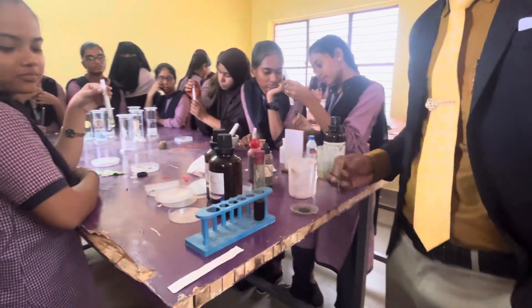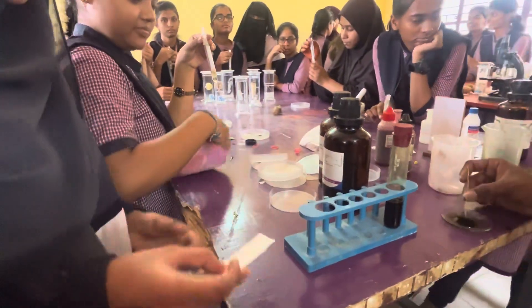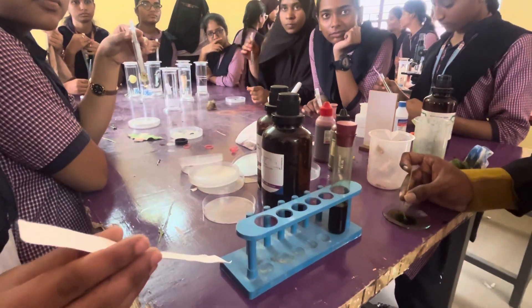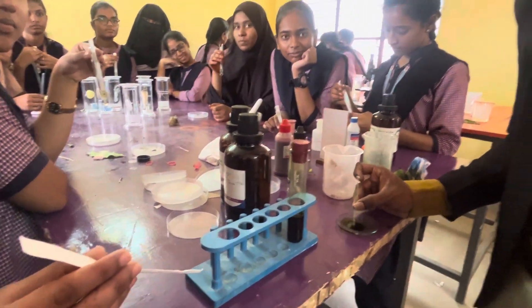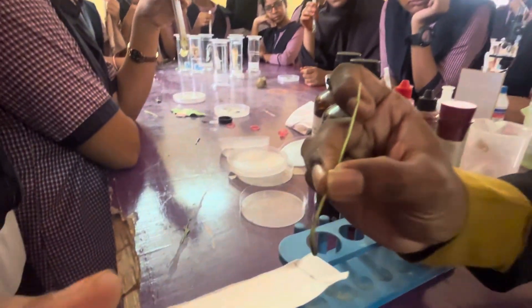Please take that paper, hold that paper — you can observe how I am adding. First we have to mix, and after mixing we have to take the mixture and carefully dot.